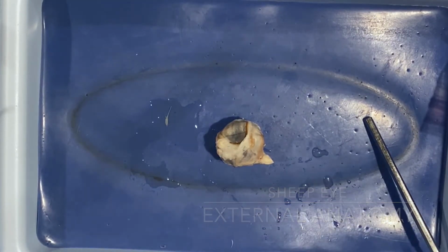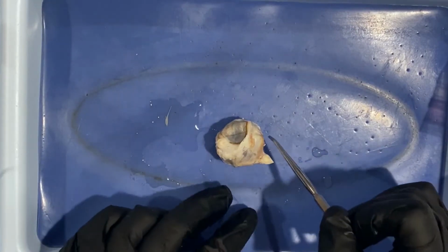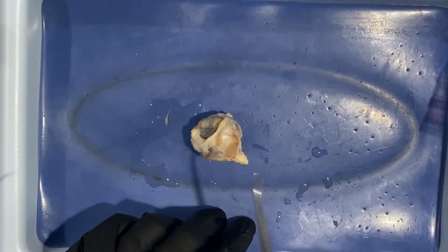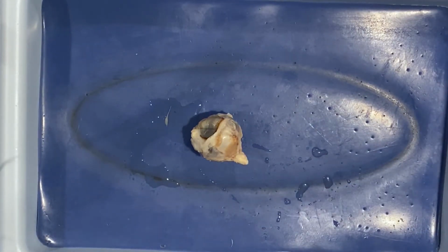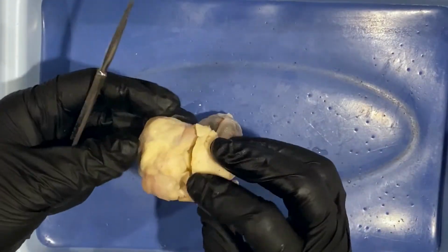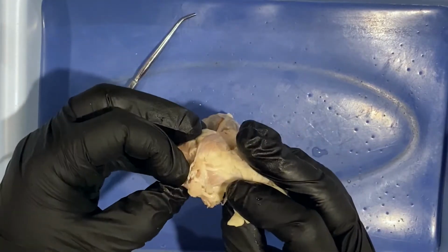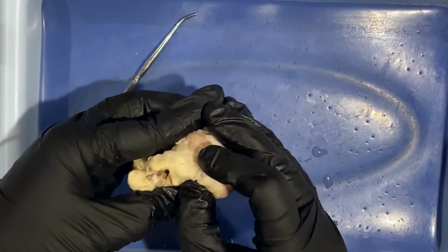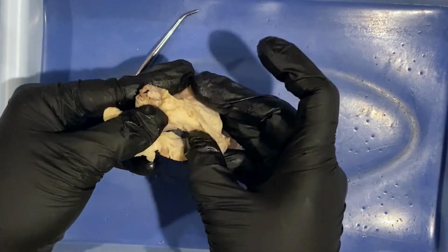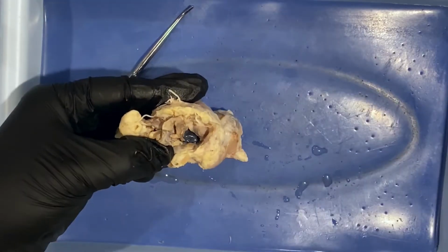This video is going to focus on the sheep eye, and typically if you were to do this dissection in your classroom, the sheep eyes would have a lot more fat and muscle surrounding and covering it. I just want to show you one that has not been cleaned, that it's kind of hard to see anything because a lot of the time the eyelids get folded over, and that dark thing that you can see in there, that is actually the cornea.